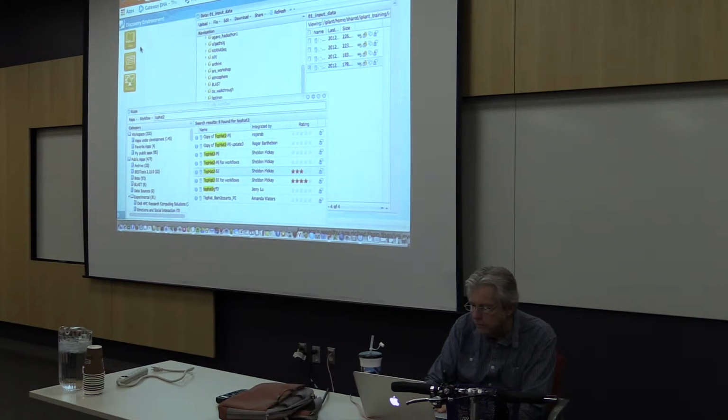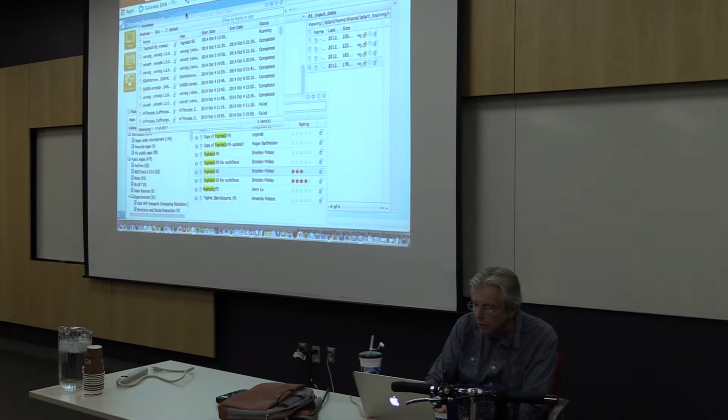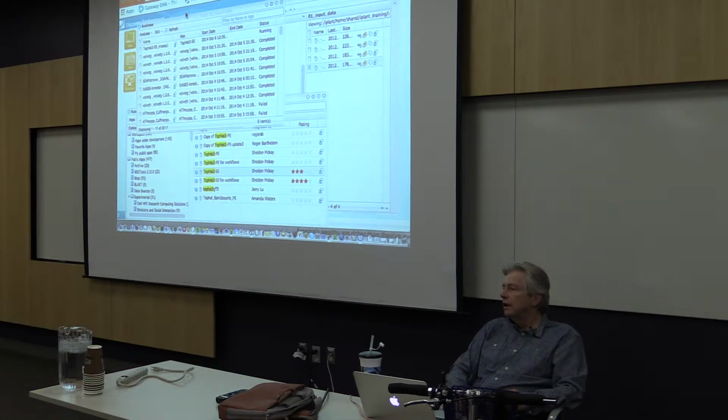This is probably a review, but again, it's important. The apps we started with are found here. Your data is here, and it's pretty obvious. The analyses section is very helpful because that's where all your results are. When you want to find the individual files in your part of the data store, it's under analyses.